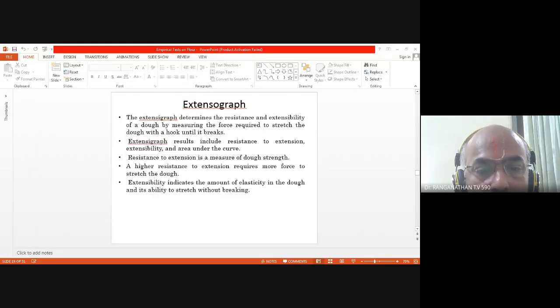Yes, sir. So that is the difference between extensograph reading and the farinograph. Farinograph is you put the dough, try to agitate it, whatever the maximum dough strength available, and the time at which the dough crumbles is what is given.